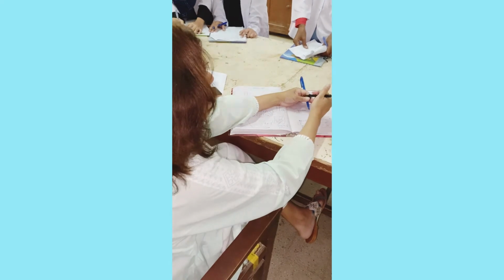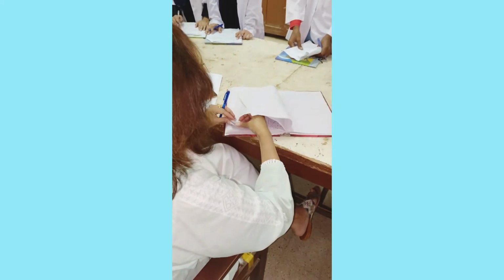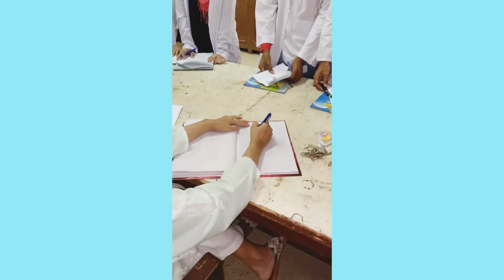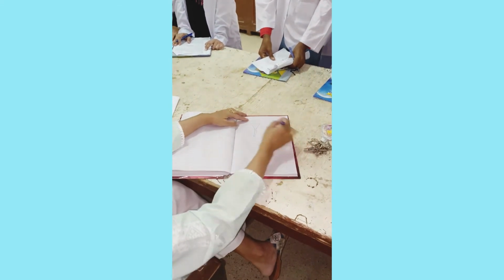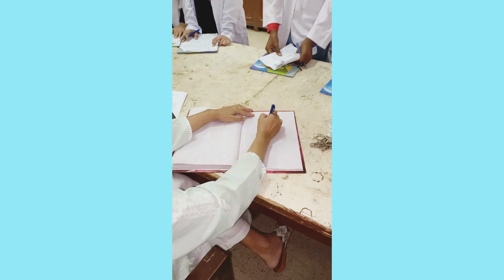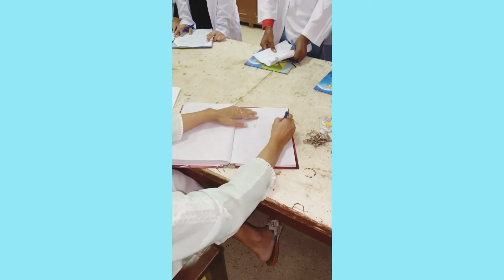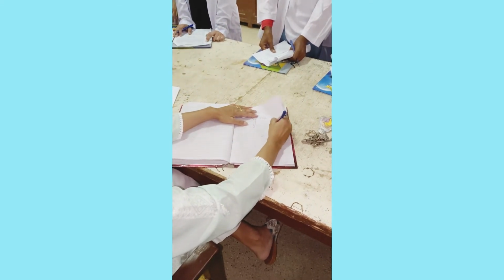Yeah. So what is going to happen now? After this, the last step is you will filter your product using a Buchner funnel. We don't have a Buchner funnel, so you will use an ordinary funnel. You will put a filter paper inside it and filter it. Now when you complete filtration, the product will be like this, right? Something like this over here.